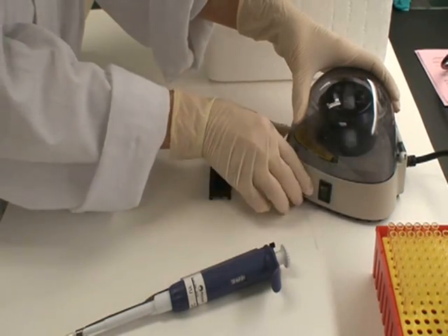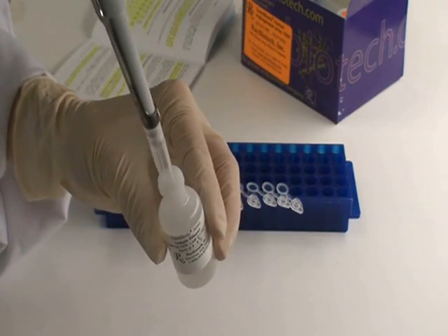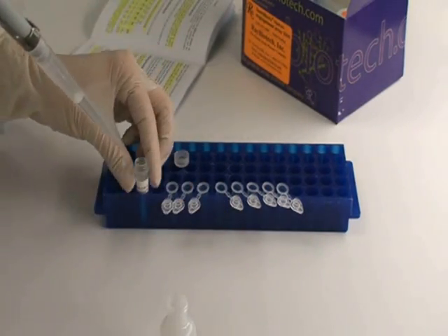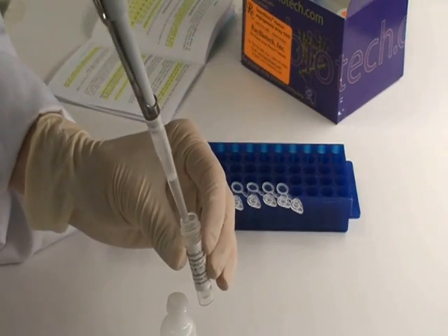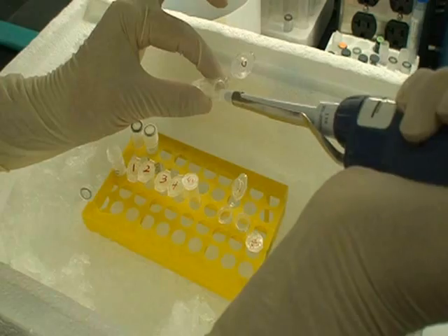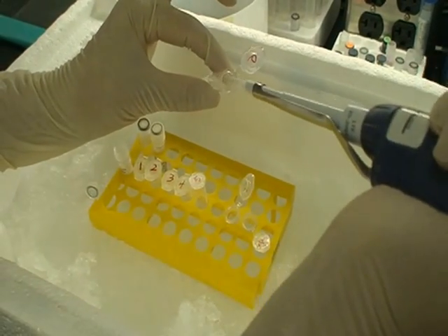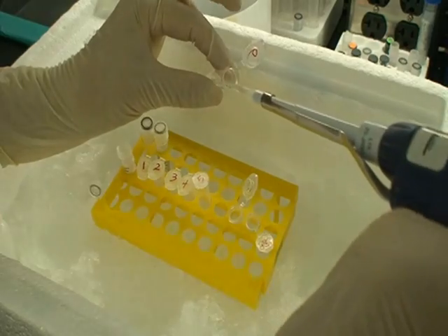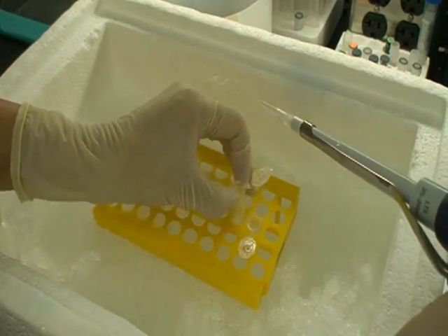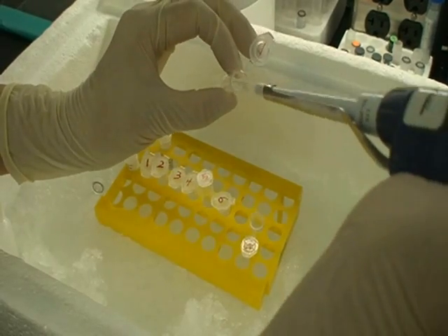To reconstitute the cytokine standards, add 500 microliters of sample diluent to the vial. For best recovery, always centrifuge the vial prior to opening. Gently mix to dissolve the powder thoroughly. In a series of 8 tubes, create a serial dilution of the cytokine standard by mixing 200 microliters of sample diluent with 100 microliters of the previous dilution.